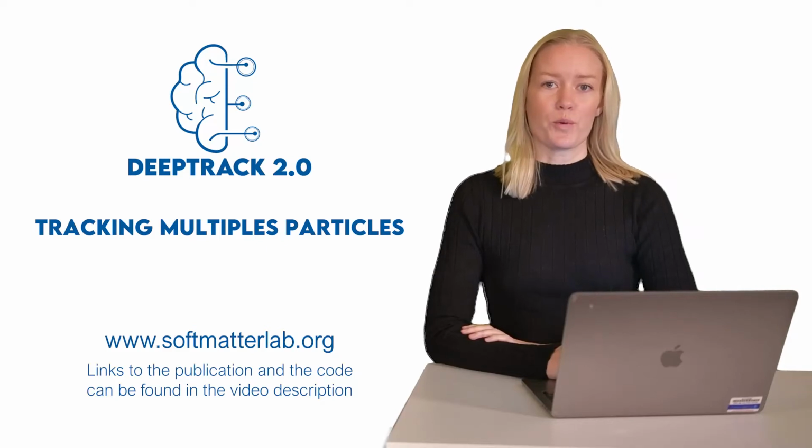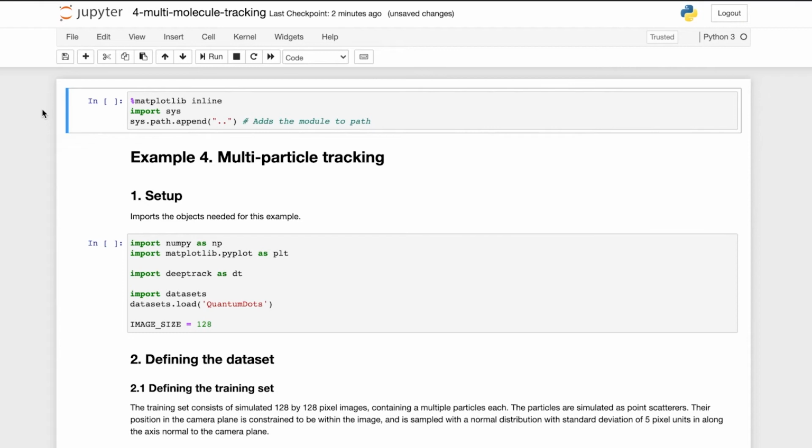In this example, we are going to use DeepTrack 2.0 to track multiple particles in 2D. Hello, I'm Saga and I will be your guide to this tutorial. Let's go through example 4, where we use DeepTrack for multiple particle tracking.